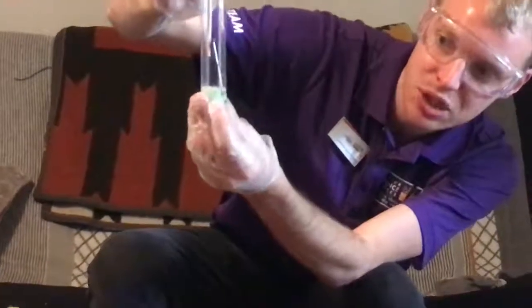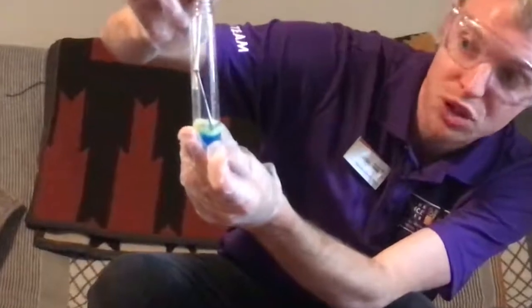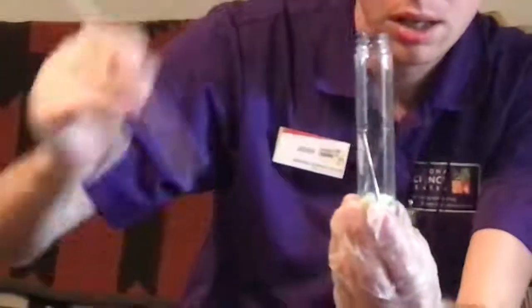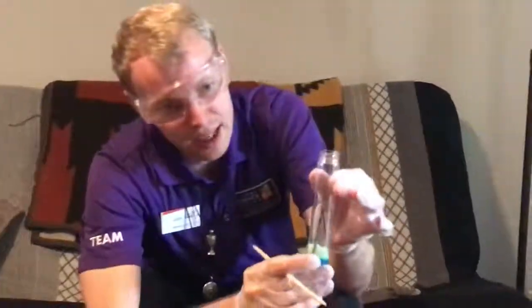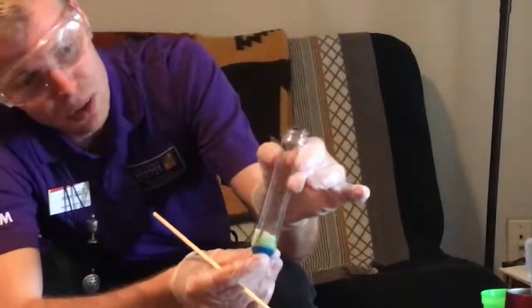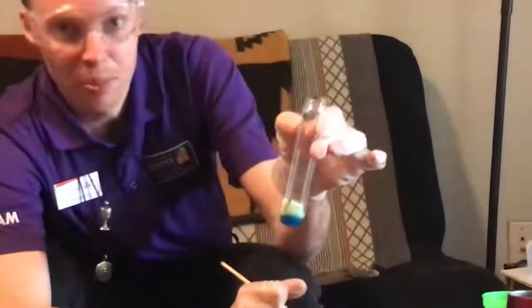So I can see that it's in the salt and water mixture, but it is not directly touching the copper crystals, or excuse me, the copper sulfate at the very bottom. And that's important, so I'm going to do the same thing again with this nail. Make sure that, poke it down a little bit. Once again, this second nail is going to go through the first layer of cotton, and I cut it pretty close, but we should still be okay, to make sure that it goes into the white part but stays away from the blue crystals. That's going to be really important.